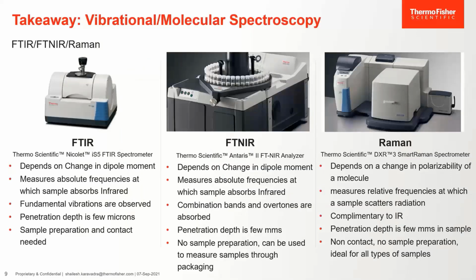There are a few takeaways that we can take from what I said before, and this slide really summarizes this. FTIR, FT-NIR, and Raman all have their place, and when combined together, either with one of the techniques or two of the techniques, it gives a powerful tool for material characterization.